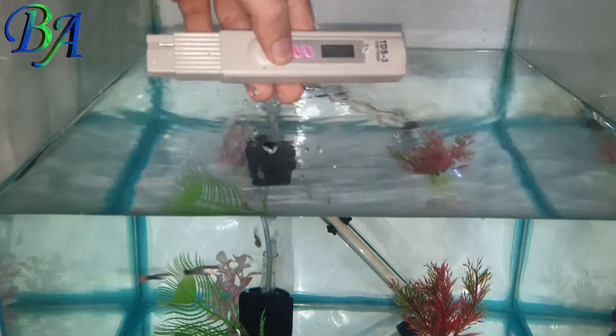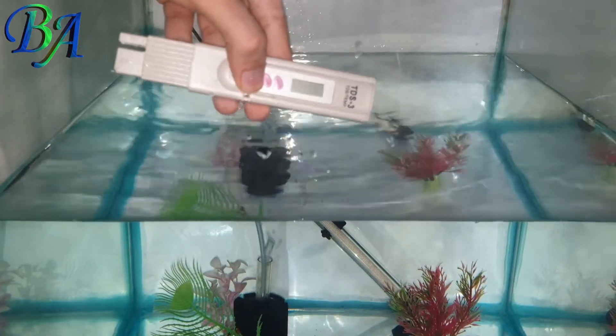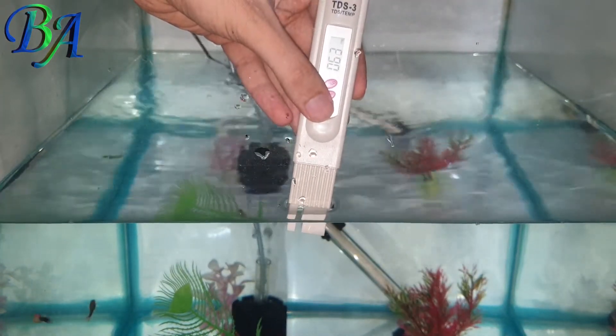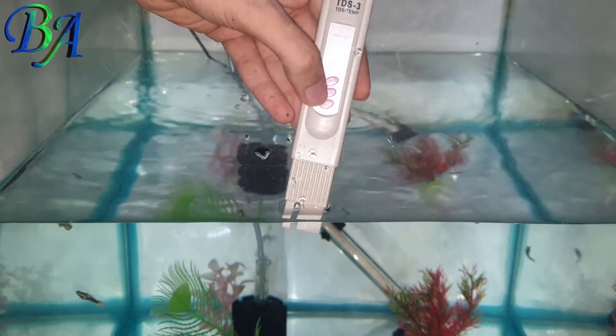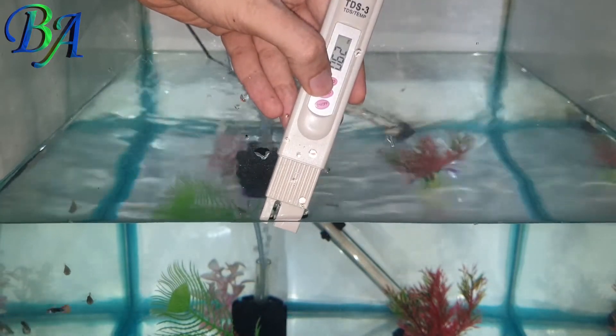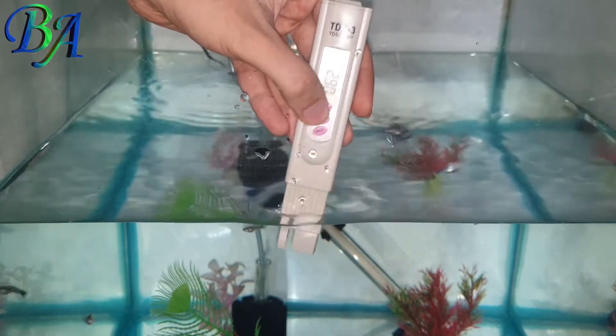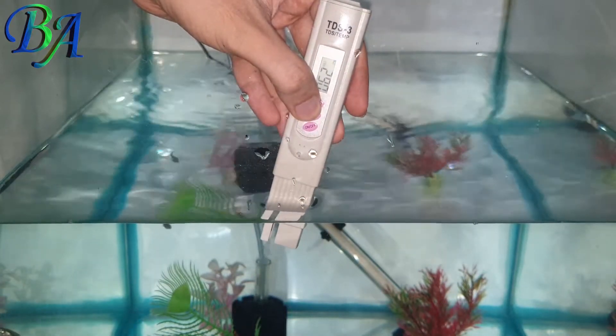This is my guppy fly tank. Let's start by switching the meter on and dipping it in the water, not above the immersion limit, and holding it for around five seconds. Now I will press and hold until the screen starts flashing — and this is the TDS of my guppy fly tank.